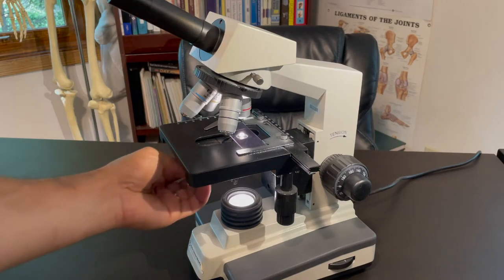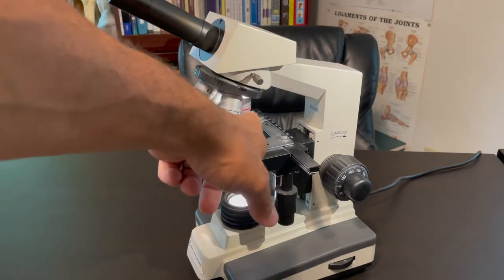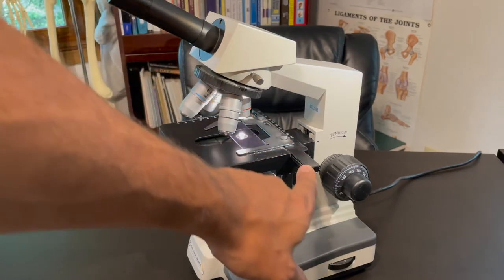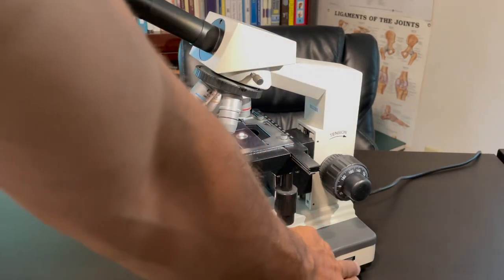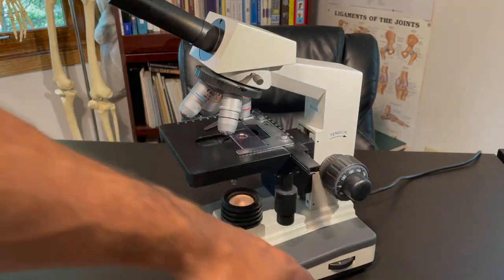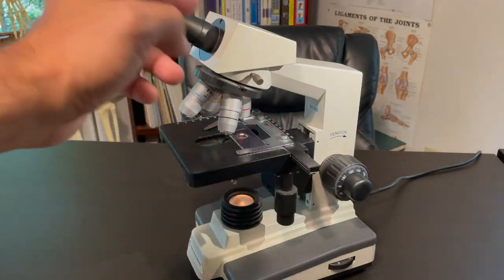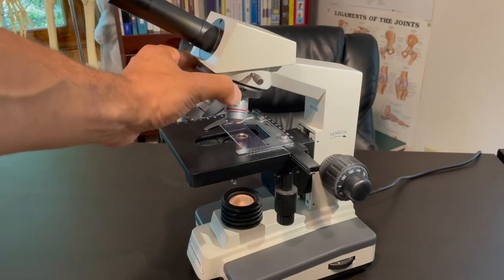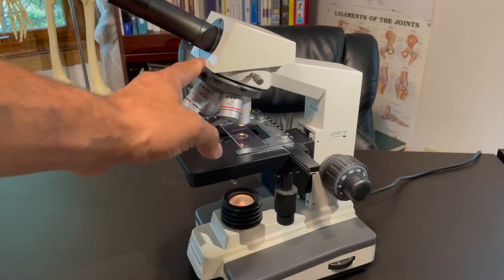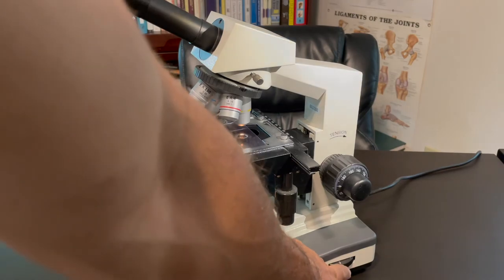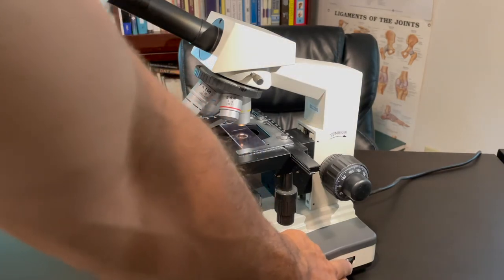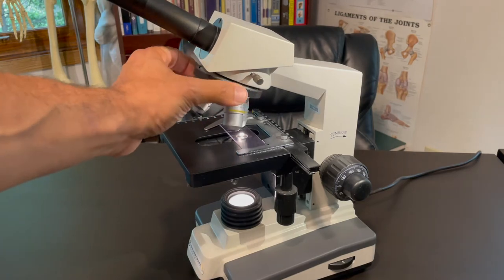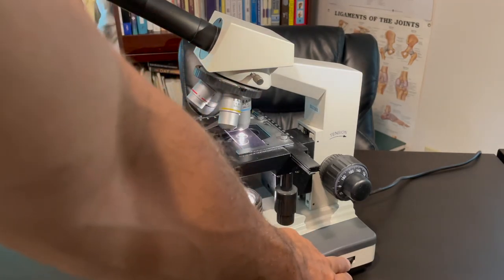And also one more thing that you'll need to do is when you first begin and you're on the 4x, when you're on the red, the light will be really, really bright. So you only use as much light as you need when you're looking through. However, as you turn up the magnification, you're going to need to turn up that light source a little bit more. And then you go to the blue, you'll need to turn up that light source even more.